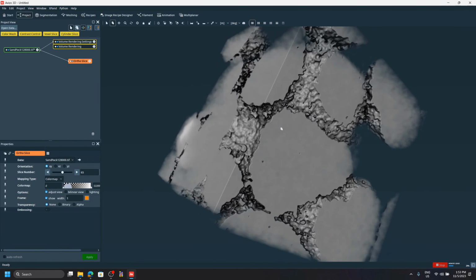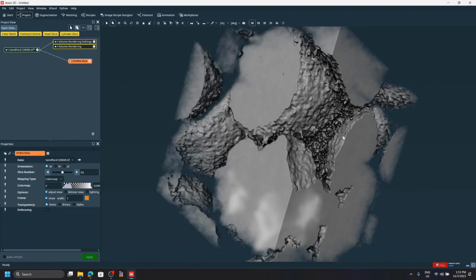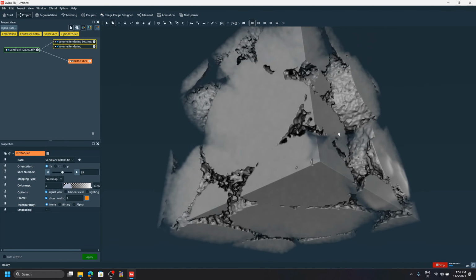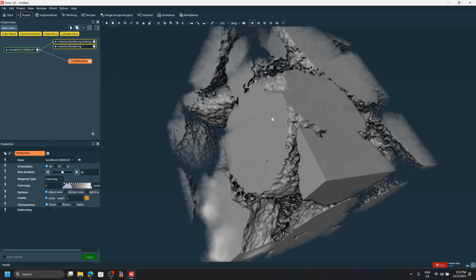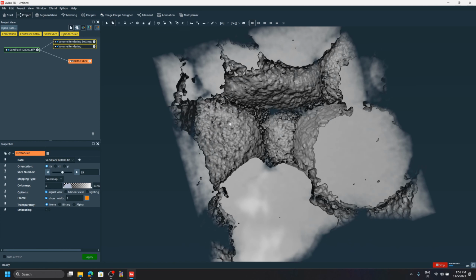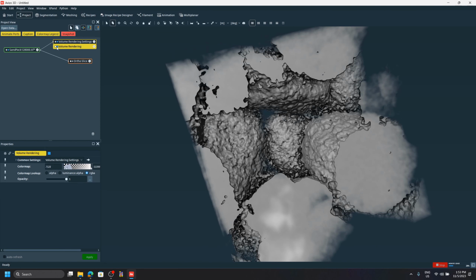Now all we see is the volume rendering, which is a 3D visualization. With this, we already have a basic picture of how the data looks, and we see the particles already. I won't go into the details of volume rendering. Hopefully you attended the basic Avizo workshop, but if you want to know more, you can reach out to us. Anyway, we're going to go ahead now and try to segment this. I want to extract the sand particles. So let me turn this off.